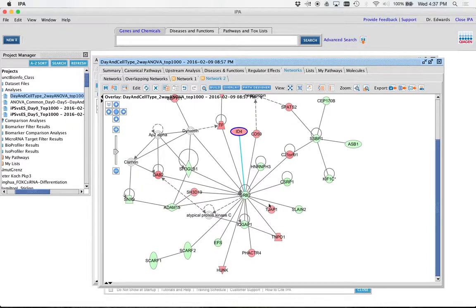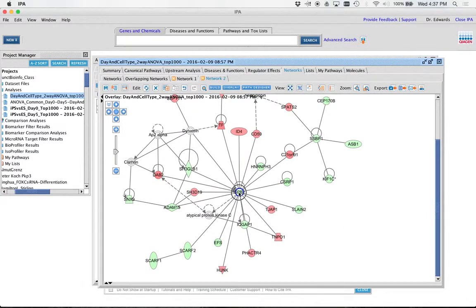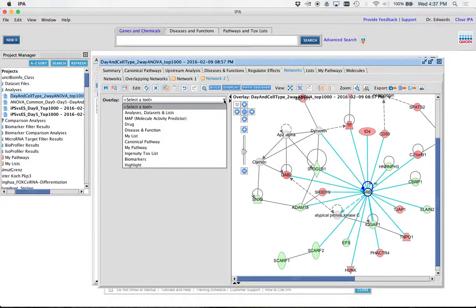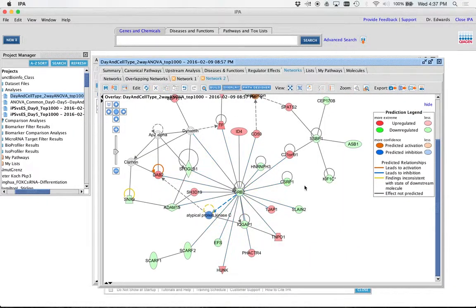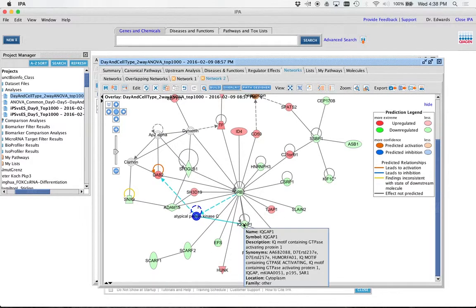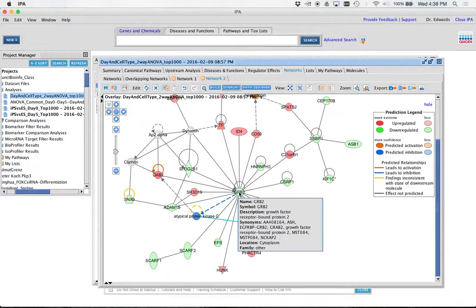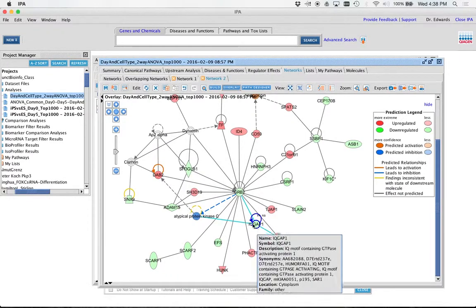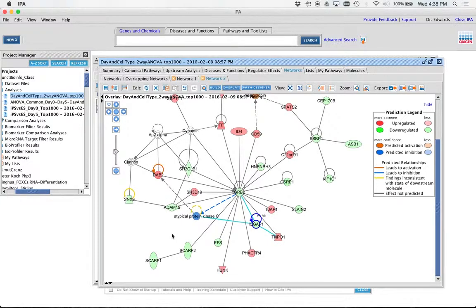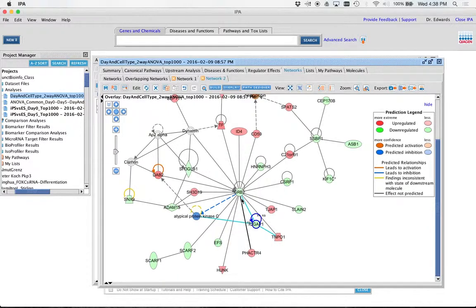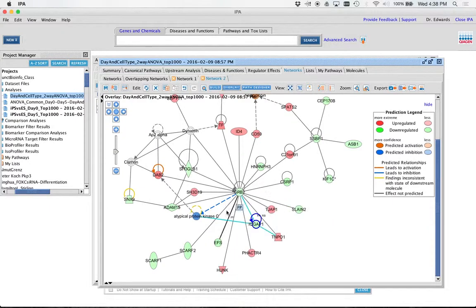Yeah. GRB2. Big time. I can even color this. Start prediction. There's a lot, it's binding a lot of things, and it's going down. It's also a growth factor receptor. What this is telling me is that in my embryonic stem cells, these things are much higher than our pluripotent. If I wanted to replicate maybe the embryonic state a little more, maybe I overexpress this in my cell type. Because look at all the things it affects.